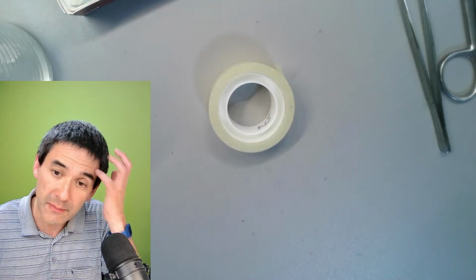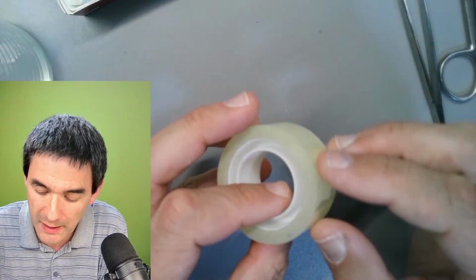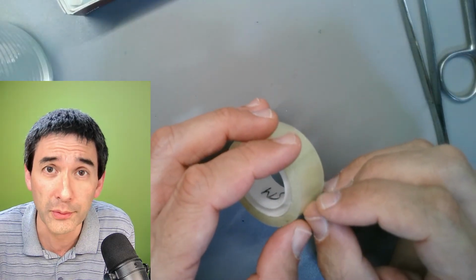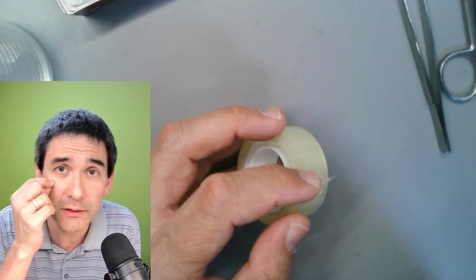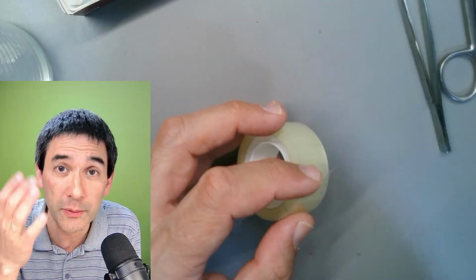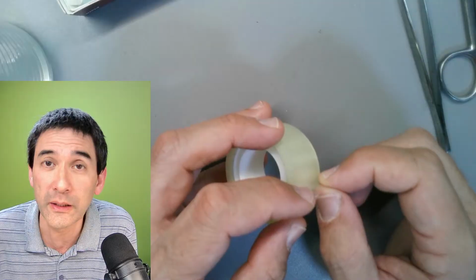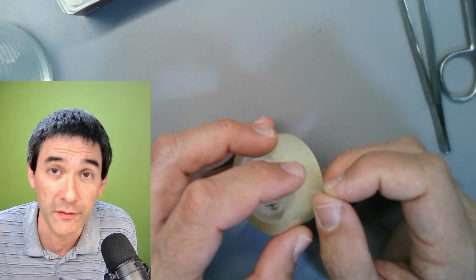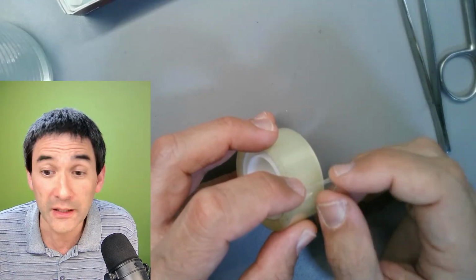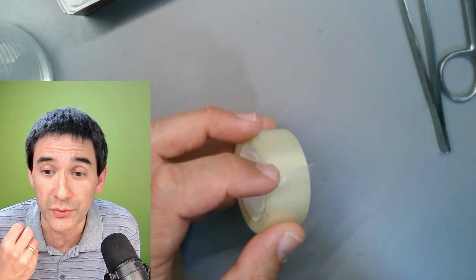There are basically many more species. Dogs have their own, cats and so on. Discovered back in the, I don't know, 19th century or so. A doctor put, I think there was some kind of a pimple in a patient, and he put some of the oily pus under the microscope, and he saw quite a few of those. And by counting the legs, they quickly identified that actually this must be some kind of a mite, because mites have 8 legs. Do they eat any kind of oil? Well, let's put it this way: at least they eat the kind of oil that we humans produce, right?